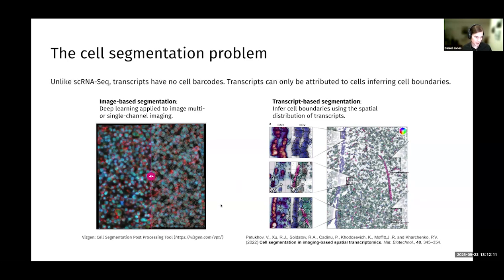this imaging data. And that's not to mention, the image might not be perfectly registered to the RNA readout and things like that. So I think this method in 2022, Baysor, really pioneered this idea. Unfortunately, it has a few problems, which we'll discuss. But this piqued our interest because it seemed to improve on the segmentation results in some ways, but has some pretty significant downsides.